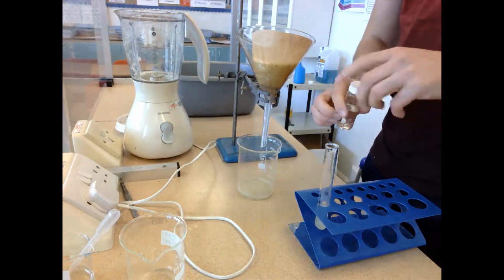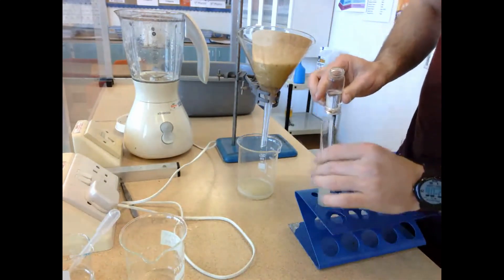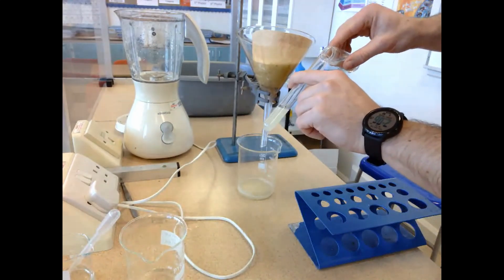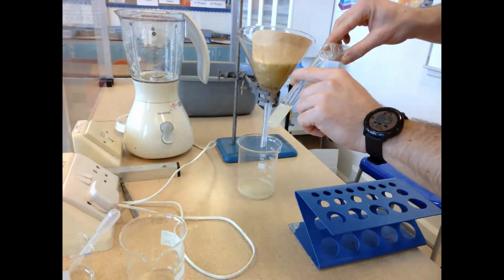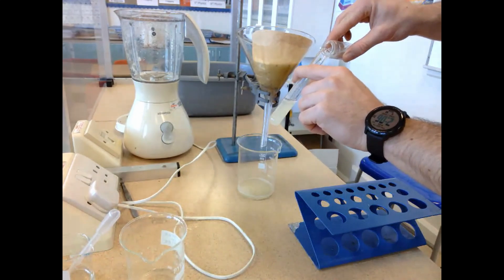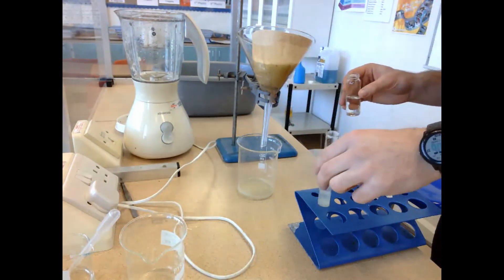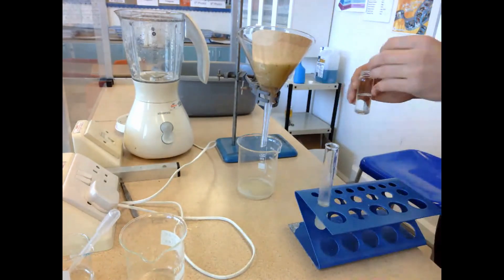So instead we jump straight to the step whereby we get ice cold ethanol and we're going to trickle this down the side of the test tube. And the reason we use ice cold ethanol is because DNA is insoluble in ice cold ethanol and therefore it'll begin to precipitate out of solution and will become visible as groups of white threads.